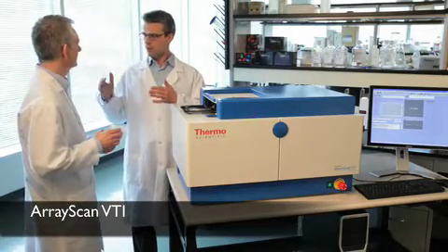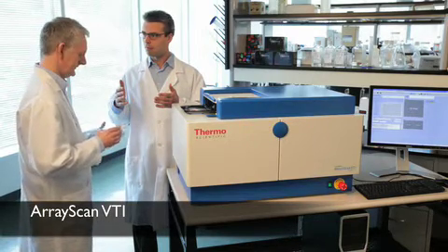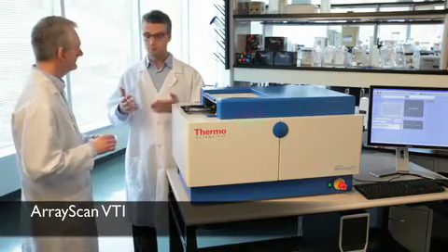It's only going to take about five minutes. Well, that's just to scan it, right? No, that's going to give you results and data. In fact, by the time you walk back from your lunch, data should be at your desktop. Really? Yep. Okay.